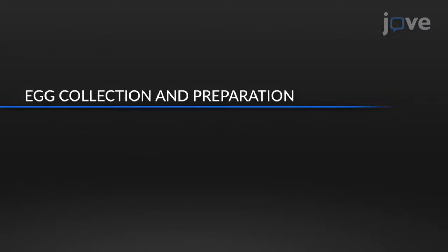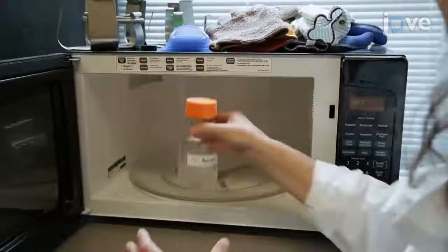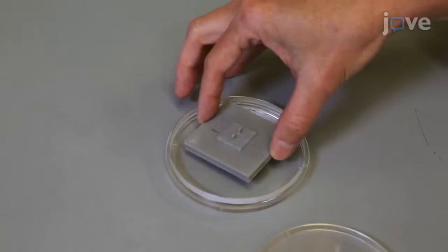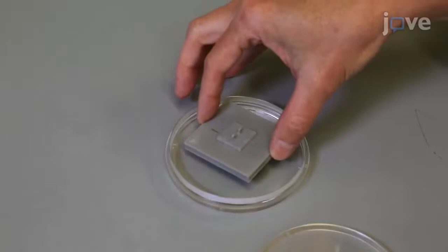First, make 40 ml of 1% agarose in water and pour it into a 10 cm petri dish. Place an egg well stamp on the surface of the agarose before it solidifies. Once the agarose is solidified, remove the stamp to reveal the wells.